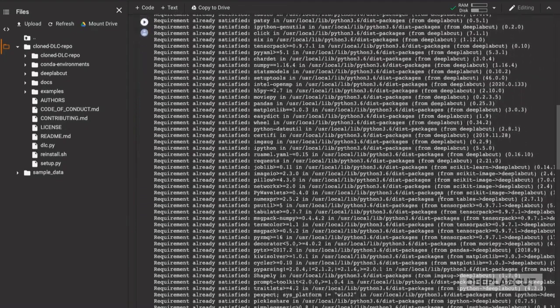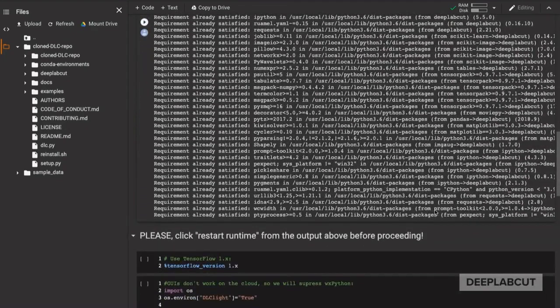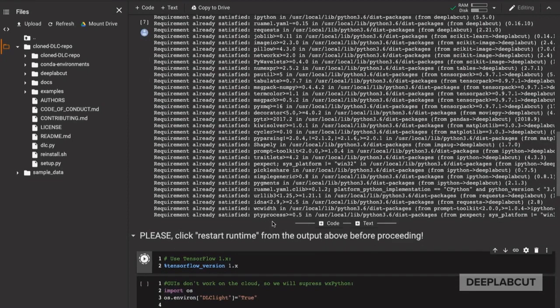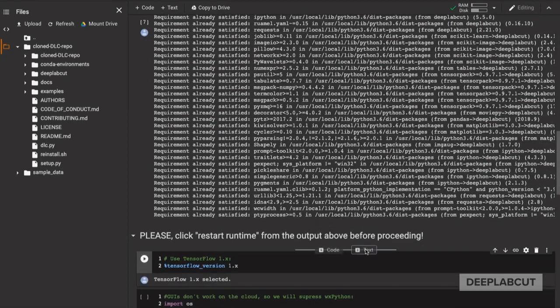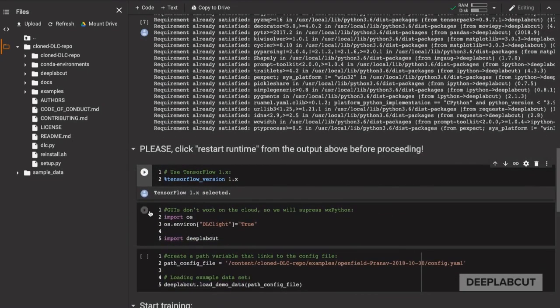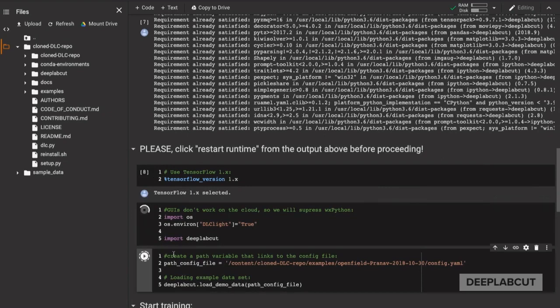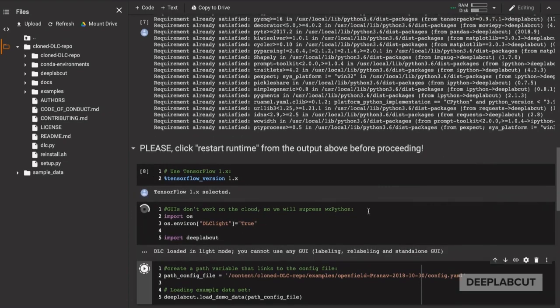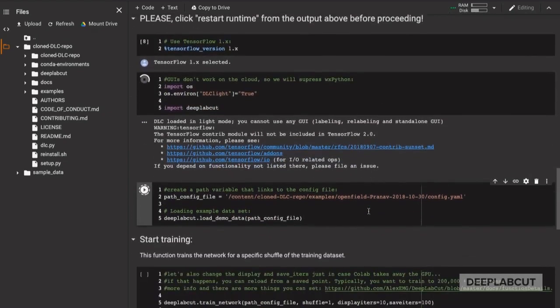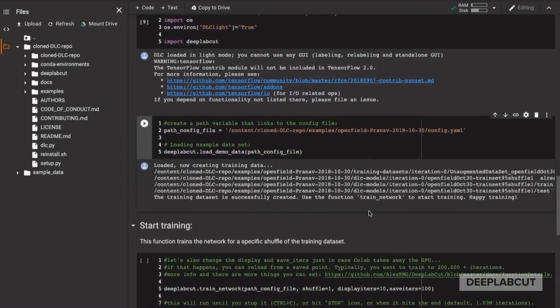To see DeepLabCut in action, it's as simple as going through the code blocks and clicking run. Be sure to follow the notes and tips that we suggest, like restarting the runtime if it hadn't been installed already.